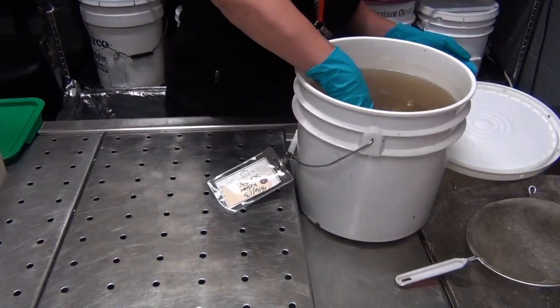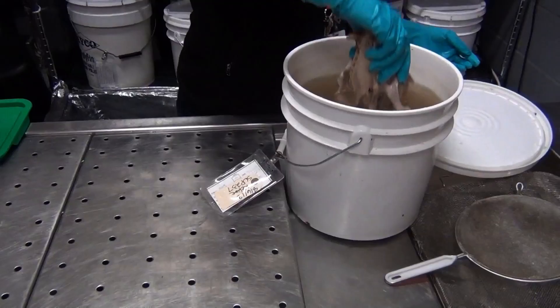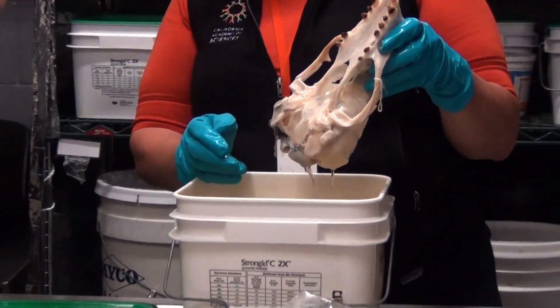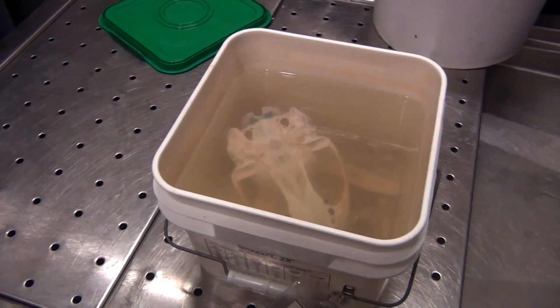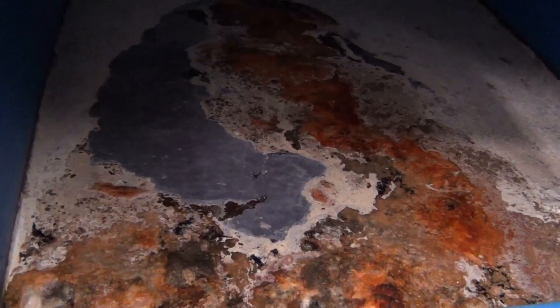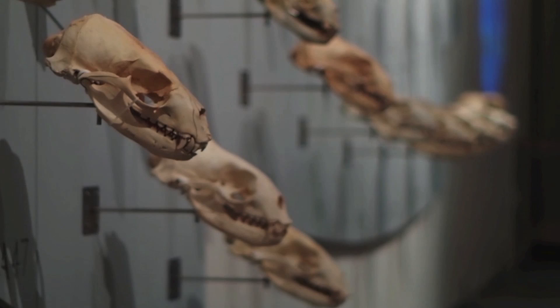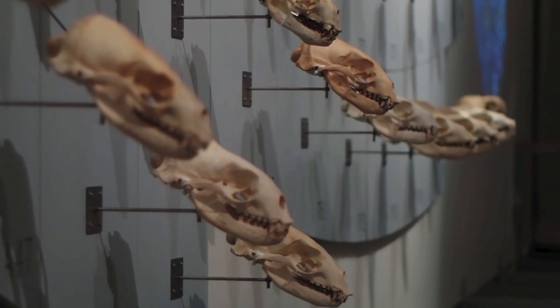If it's an adult — a harbor seal, a California sea lion, or a Steller sea lion — it goes into buckets of water. After removing as much flesh as possible, they scoop out the brains and use bacterial maceration. Large specimens go through maceration, where the bones are placed into a giant tub of water and bacteria slowly consume the flesh, leaving only bone.